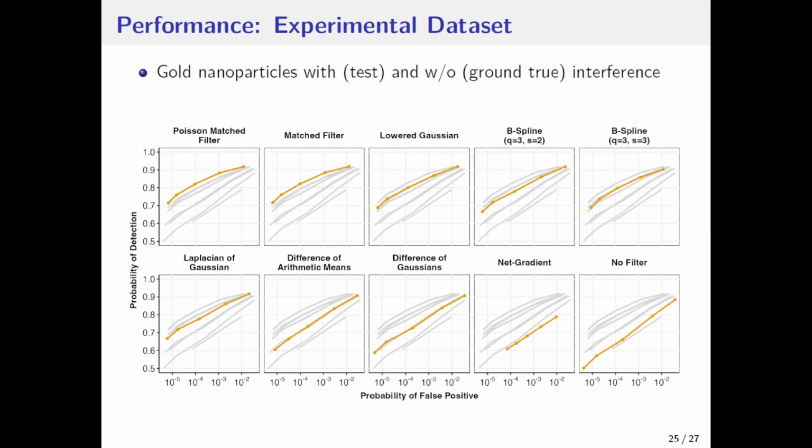When you present a theoretically based result, a very often asked and perfectly relevant question is how it performs in the lab, on non-synthetic data. One problem in evaluating on experimental data is that in order to quantitatively compare the methods, we need to know the ground truth, where the molecule actually was, and this is impossible.